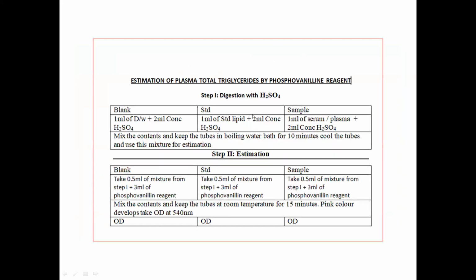Now on my screen, plasma triglyceride phosphovanillin reagent procedure is visible. Yes, ma'am. Okay. In that, step 1 is the digestion, step 2 is the estimation.